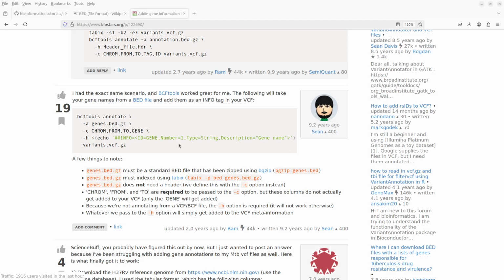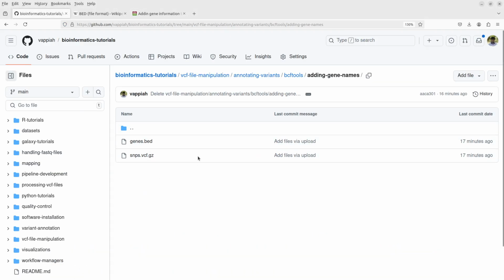Now let's proceed. We need to get our input files. I'm assuming that you already have your system set up. I repeat, I'm assuming that you already have your PC set up, so you are ready to go. We will need two input files.